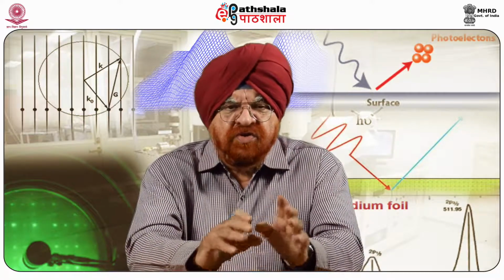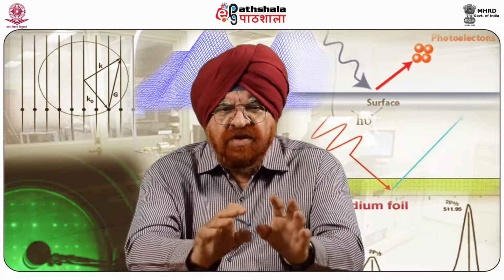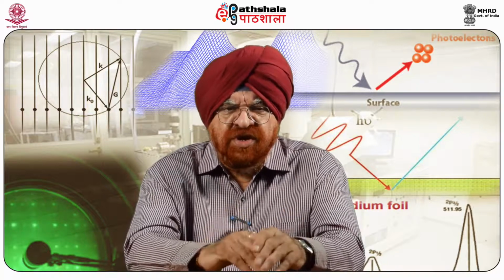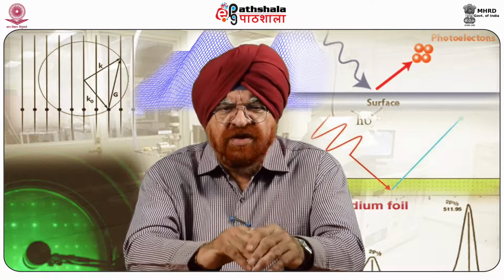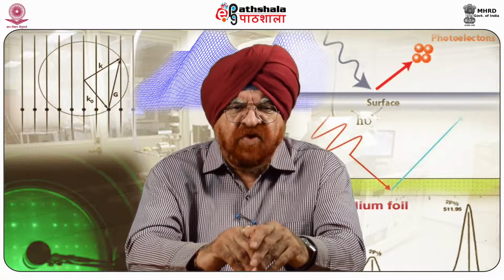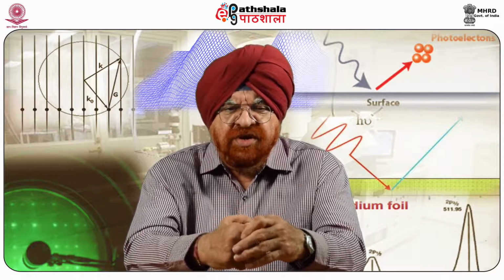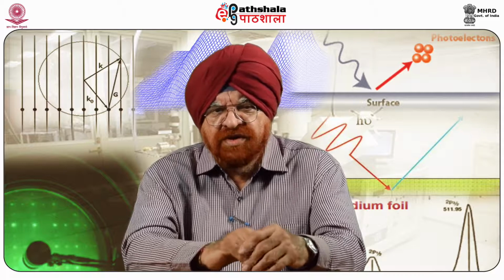Note that the MFM voltage pattern due to the presence of magnetic vortices in the structure is a little more difficult to record. It is interesting to observe the quite different topographic, that is AFM profile, and magnetic MFM voltage patterns achieved from the very same structure exclusively due to the presence of magnetic activity.